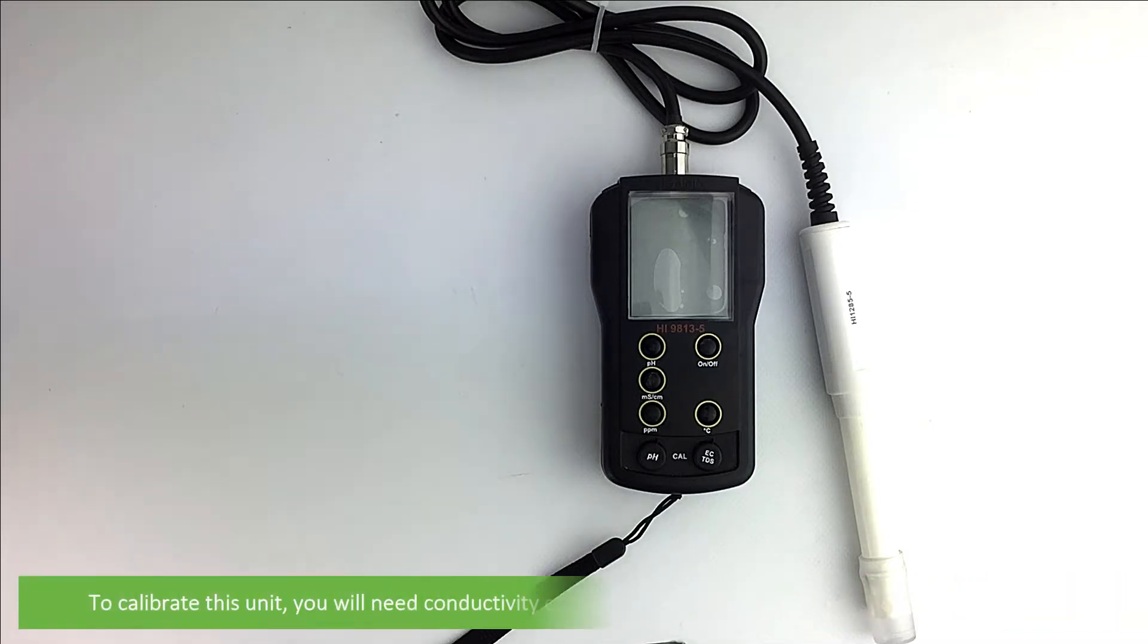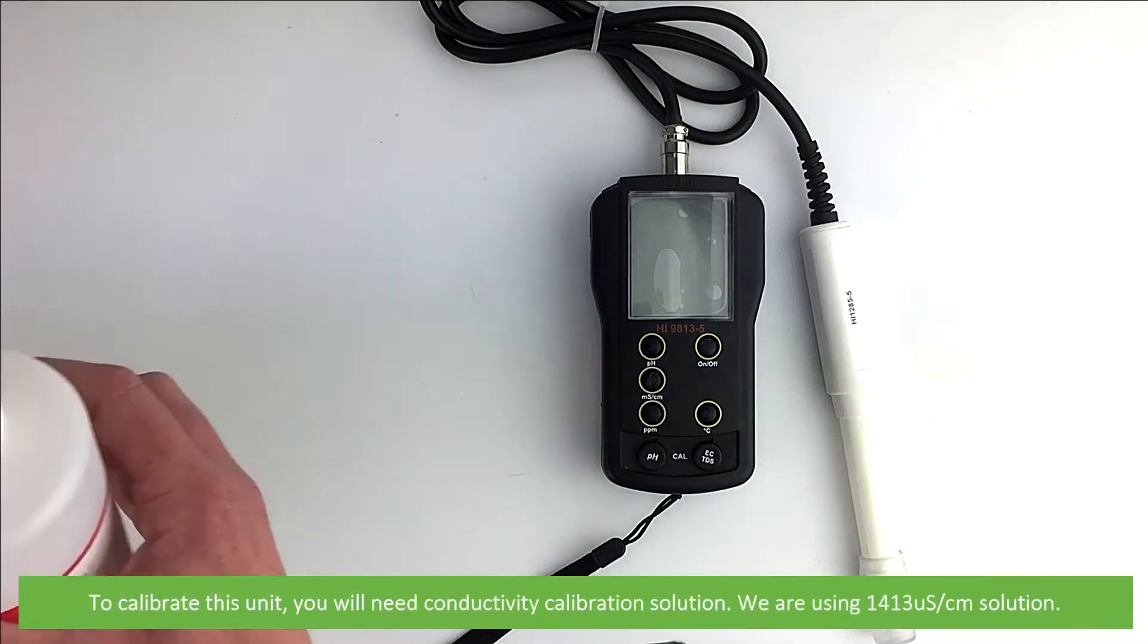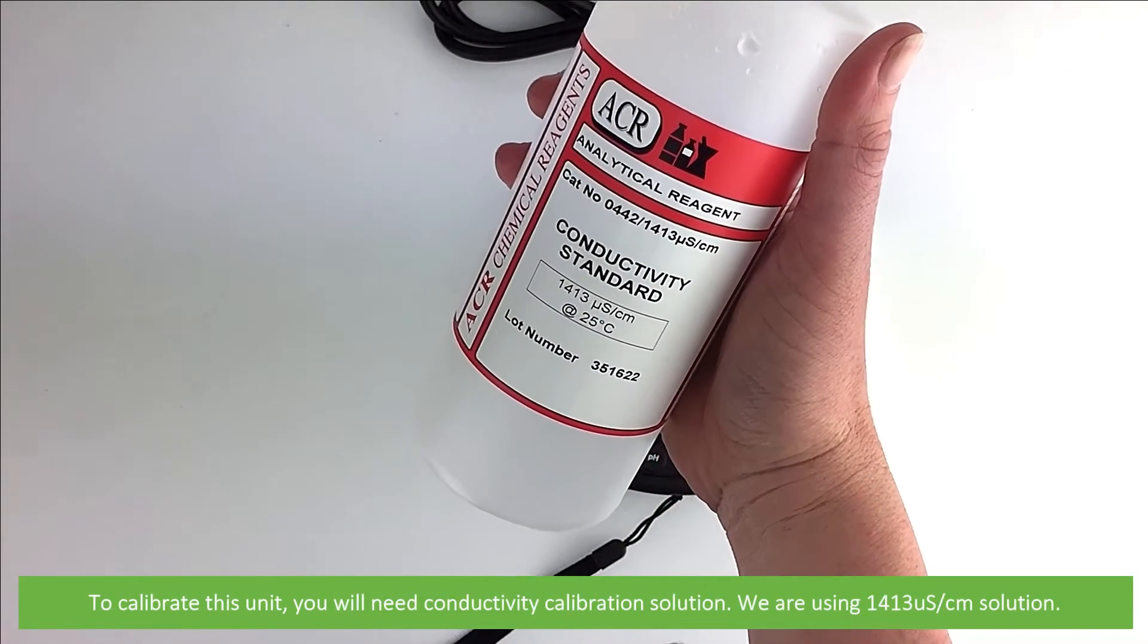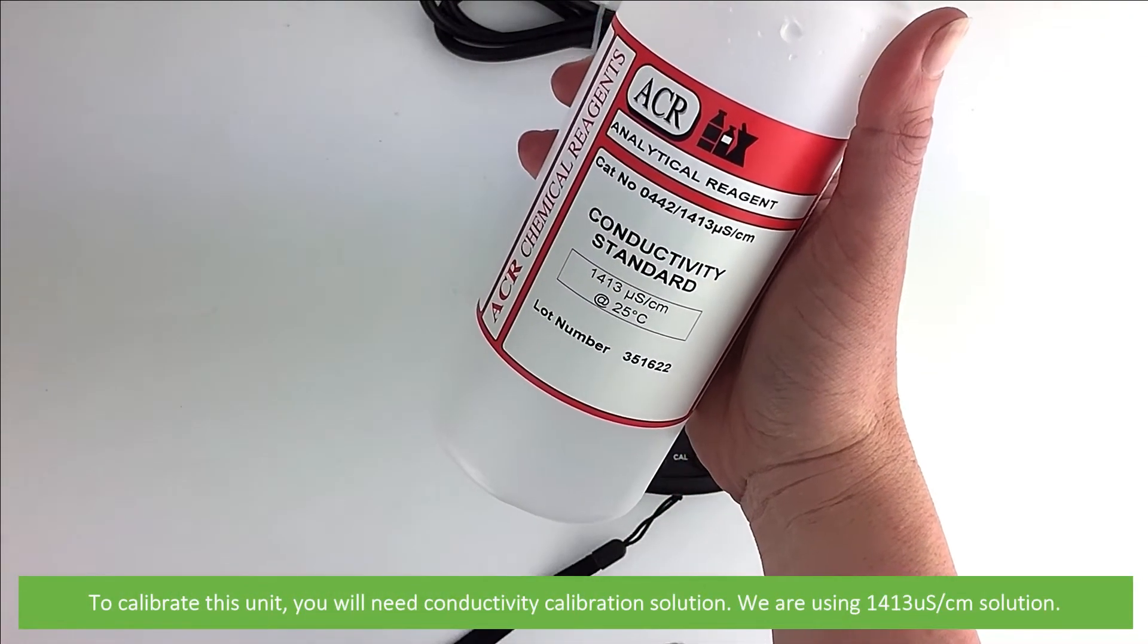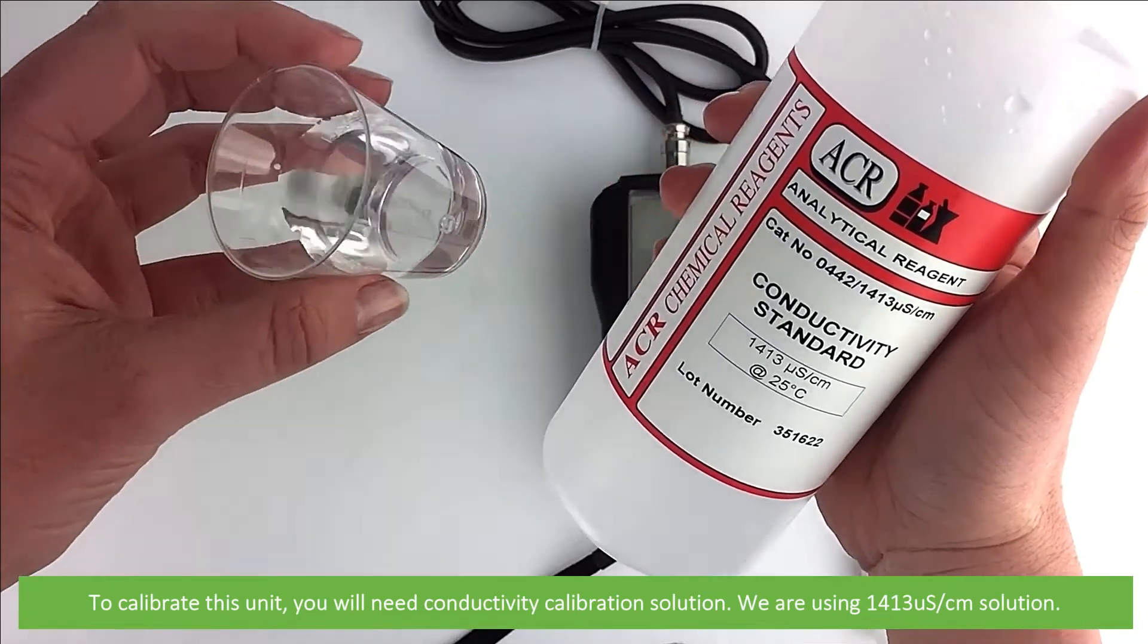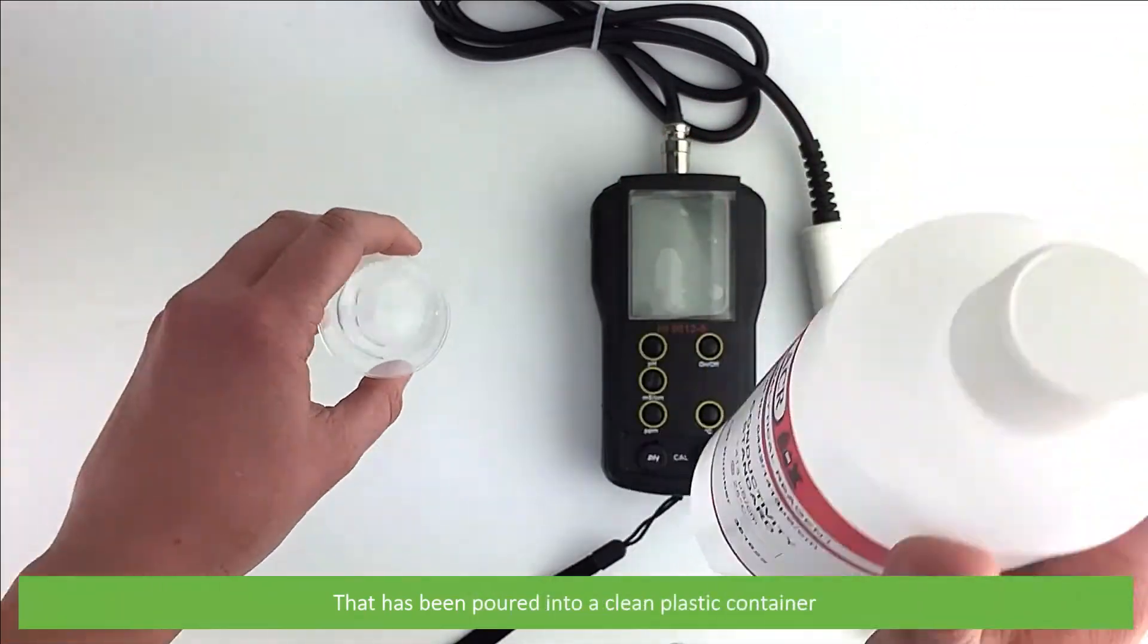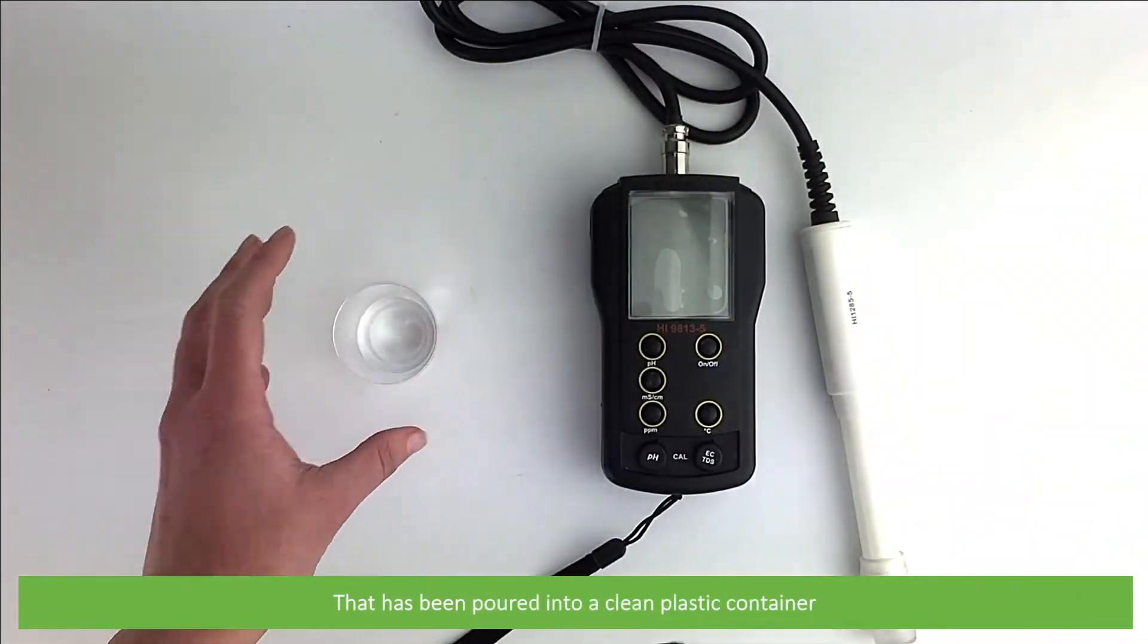To calibrate this unit you will need conductivity calibration solution. We're using 1413 microsiemens per centimeter solution. This has been pre-poured into a clean plastic container.